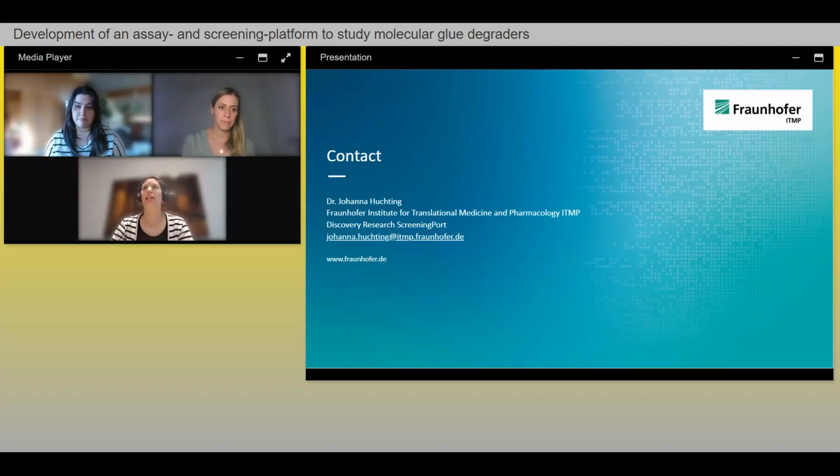And then I would say the liquid handling steps are actually quite critical, because you're working with small amounts and you're working with endogenous targets. So wherever you have a slight variation, just because of liquid handling variation, it would clearly show in your signals. You would really see variation in your signals. So we did spend time developing our workflow and really being sure of the liquid handling steps. So that's something that you really need.